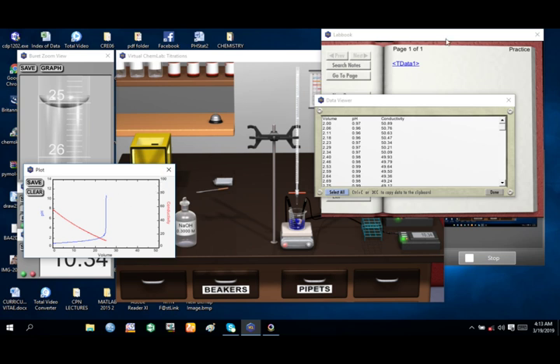When you are through with the experiment, remember that it was exactly at the end point that this thing changed. You can scroll and see the end point. So you can copy the whole thing to Excel program.